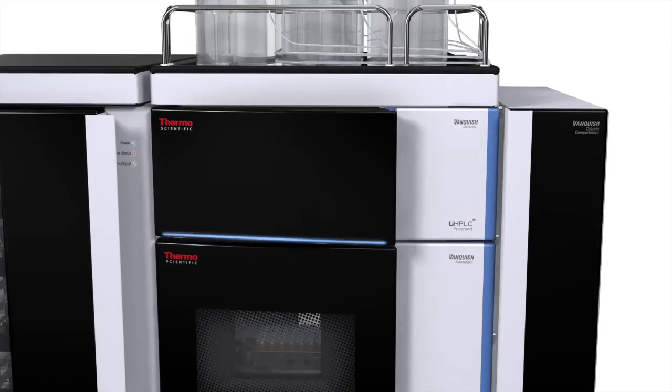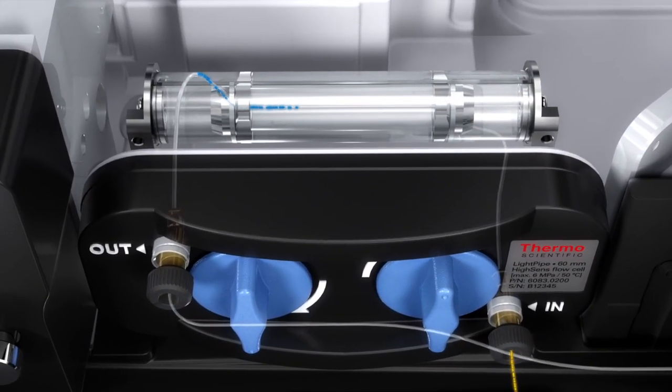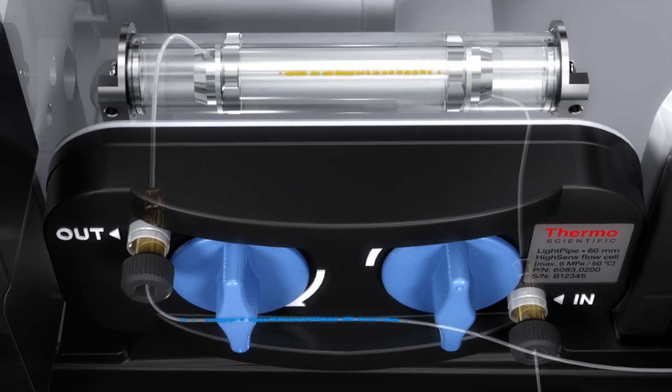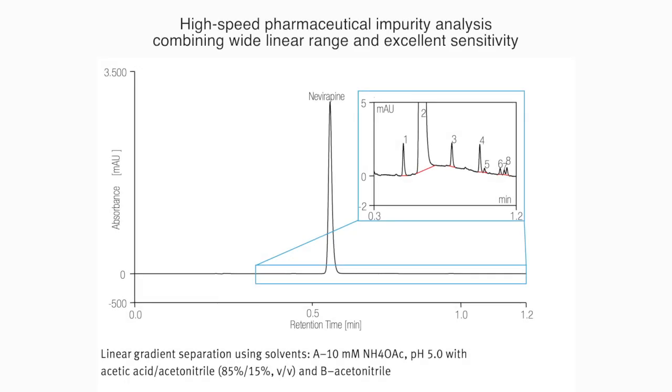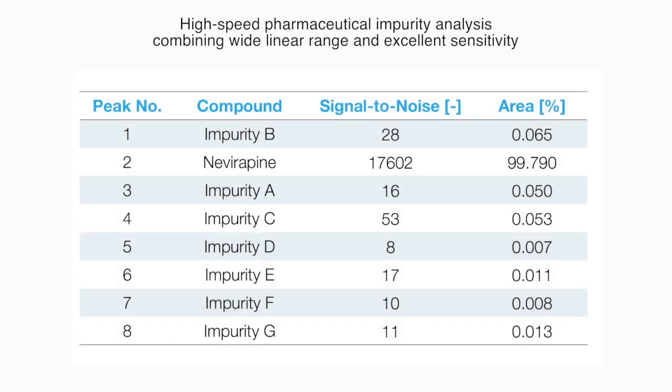The Vanquish system features Thermo Scientific light pipe technology flow cells. The 6 cm optical path length and industry-leading signal-to-noise performance will ensure excellent sensitivity, allowing you to detect compounds in impurity profiling experiments. The wide linear range of up to 3 absorbance units will ensure that the main compounds are still detected accurately.